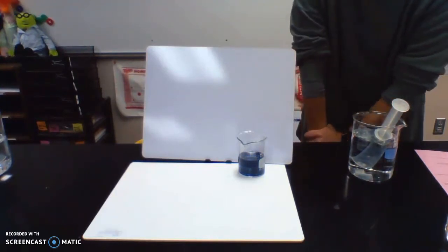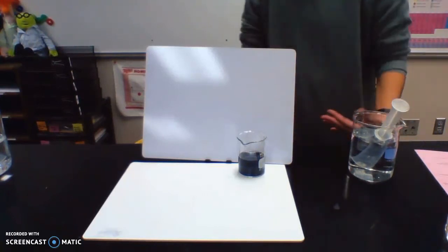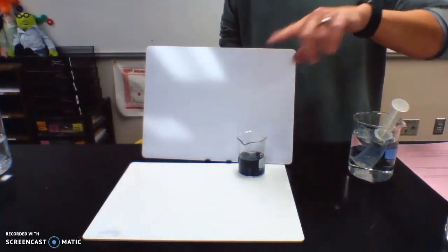As soon as the color change started, stop it, and if you need to rewind and do it again because you messed up, you can. All right, so that was mixture number 1.